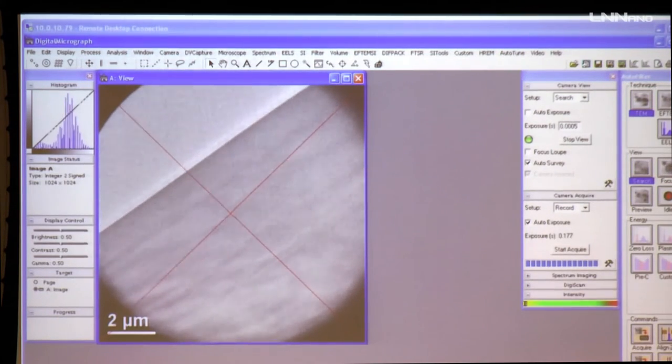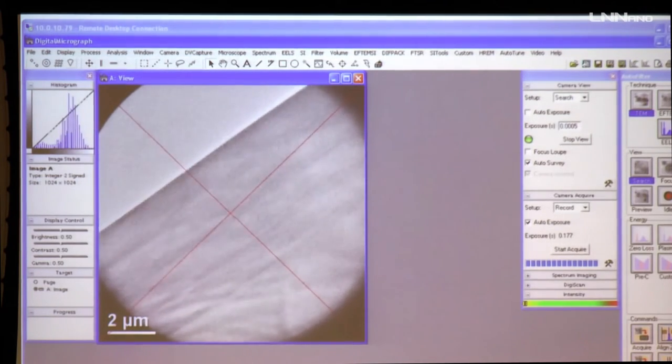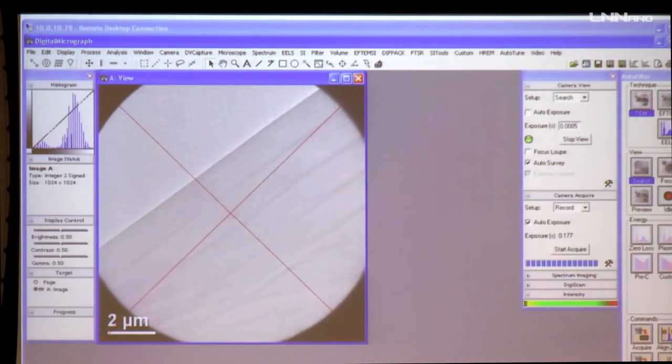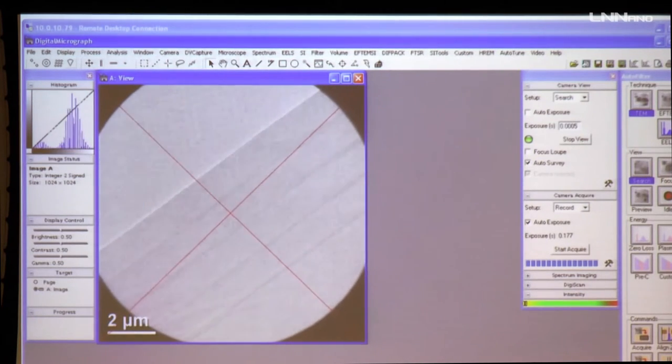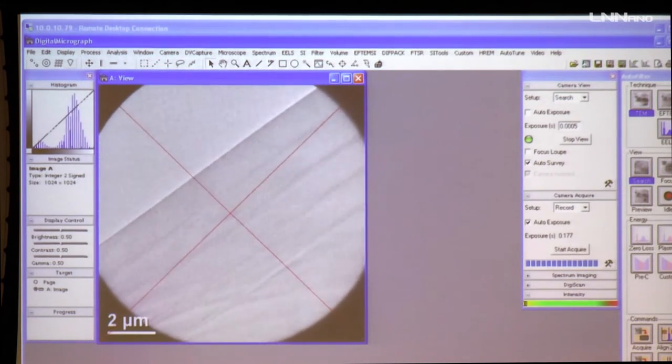I need to reduce that movement by changing the height, so that there's no movement or really very low movement. If I go further, it starts wobbling again. That's bad, so I need to correct it. So now there is very low movement. That's it. Now I switch off the wobbler. We have two options for wobbling, image X and image Y, which means we can wobble the image in X direction or Y direction, two different directions. We can use whichever one we want. It doesn't matter.